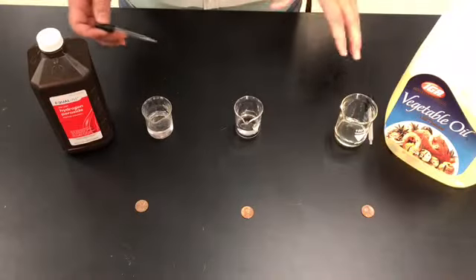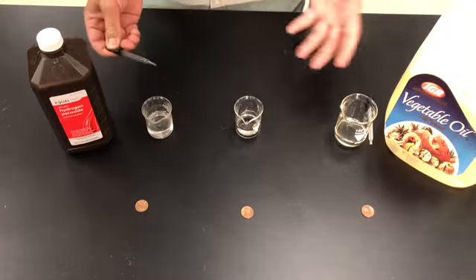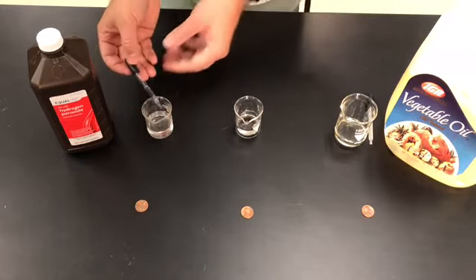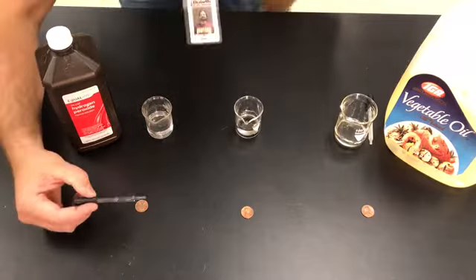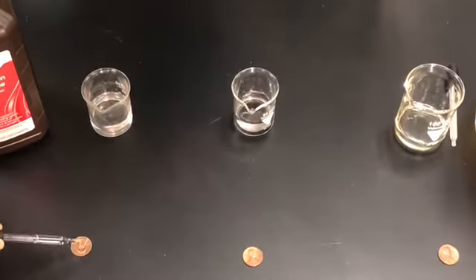Alright, so what we're going to be doing in this experiment is simply taking drops of different liquids and putting them on the penny. So I'll use this eyedropper here. And this liquid on this side is hydrogen peroxide. And I'm just going to very gently add drops. There's 1 drop.